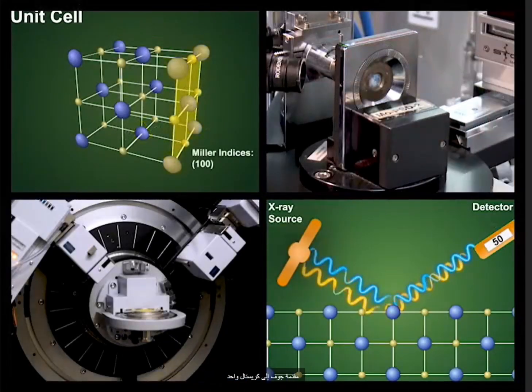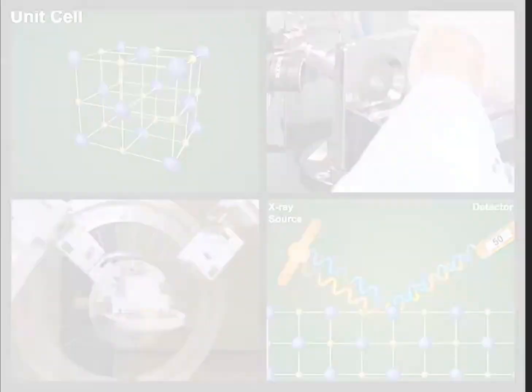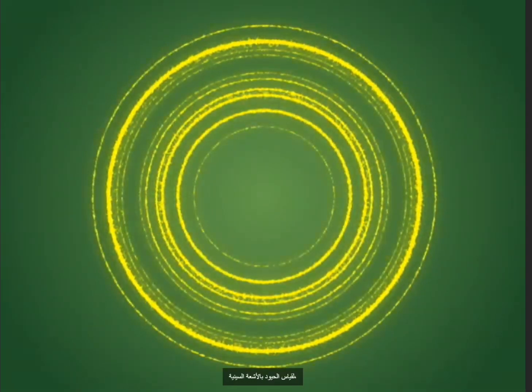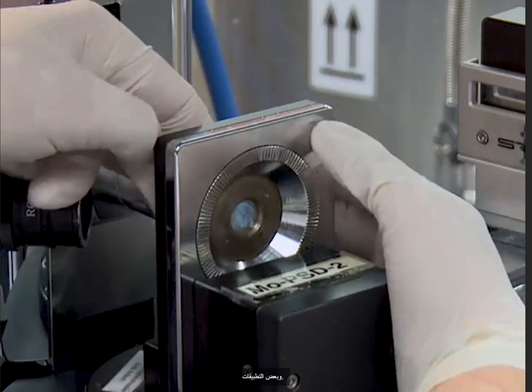You've just watched JoVE's introduction to single crystal and powder X-ray diffraction. You should now be familiar with the principles of X-ray diffractometry, a procedure for obtaining diffraction patterns, and some applications.